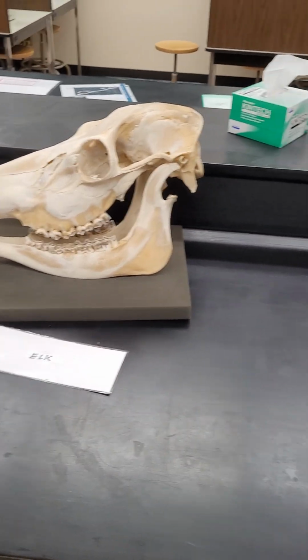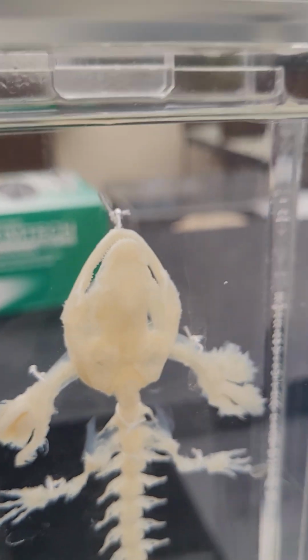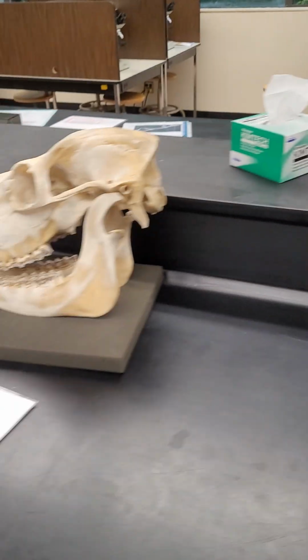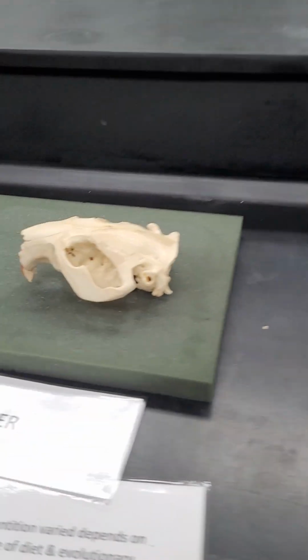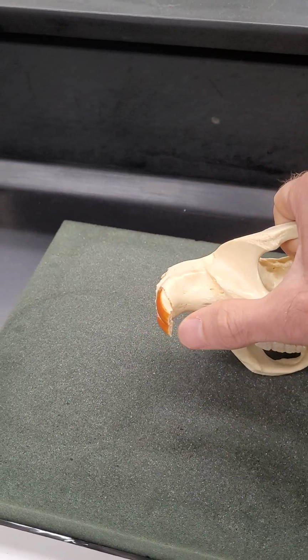We can also have a nice little look here at the dentition in terms of whether it's the same or different. So if you have a look at an alligator gar, teeth are all the same. A lizard, teeth are all broadly the same. This one might actually be a mud puppy. Yes, it is. So when you move to a mammal, we are heterodont. So the others are homodont, mammals are heterodont. Different teeth for different functions. Here's a good example of that. You've got your grinding teeth and your incisor teeth.